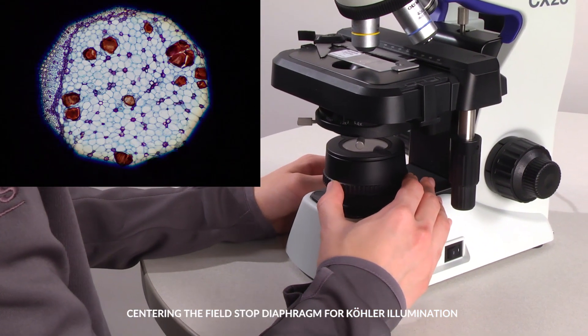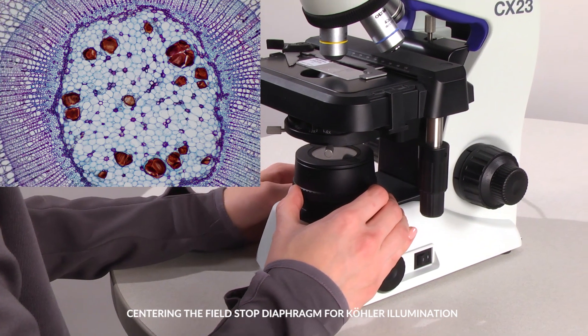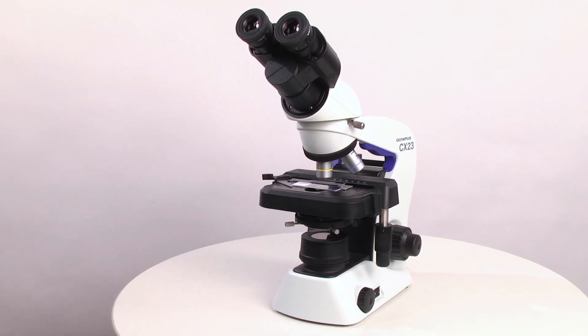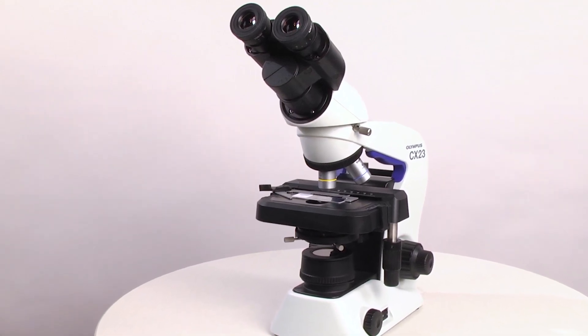Rotate the field diaphragm ring to the left to open it until you see your specimen in the whole field of view. Your CX-23 microscope is now properly aligned and ready for viewing.